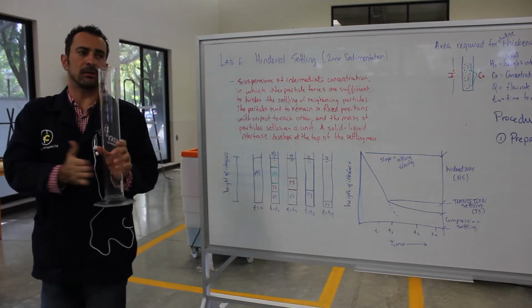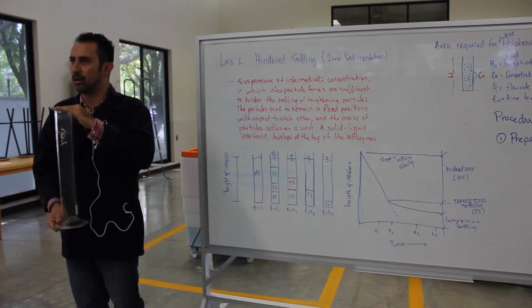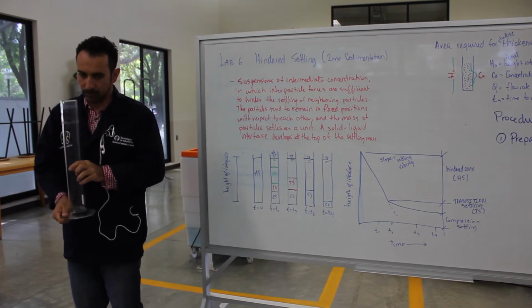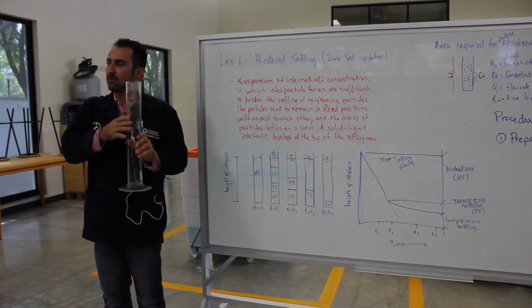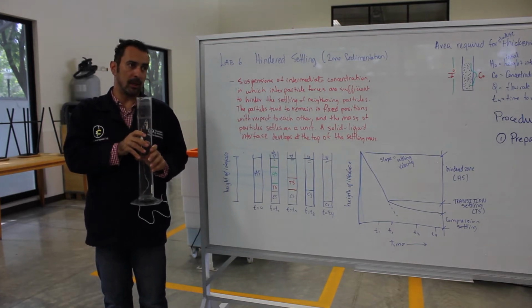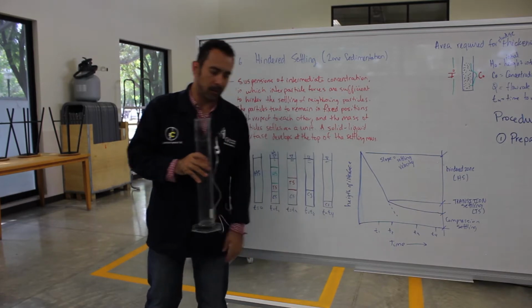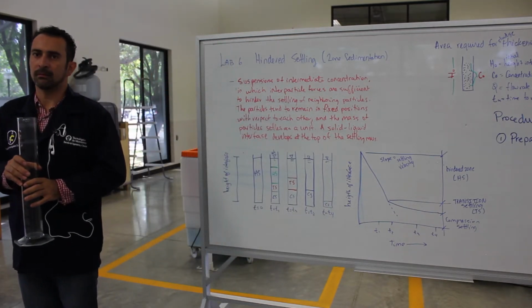Our first cylinder will be entirely just the wastewater sample, so you can observe how the particles settle, but since the concentration is greater, the settling will be slower, okay? So it's basically the opposite of our graph here, okay? Are we ready? Yes. All right, let's do this.